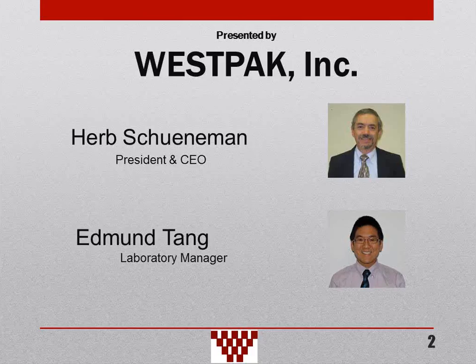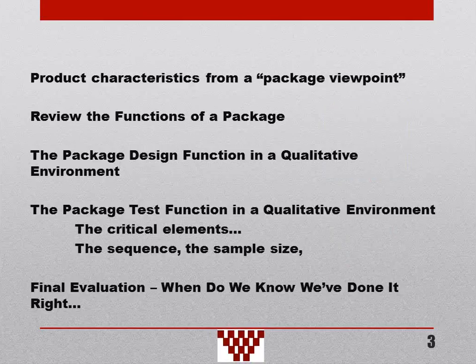What we're going to talk about today is package integrity testing. I'm going to try to define that for you, and then define the purposes of the testing, and then how it's done, and how you can tell when a good job has been done. So this is an overview of what we're going to be talking about for the next 45 minutes or so, to allow time for questions.